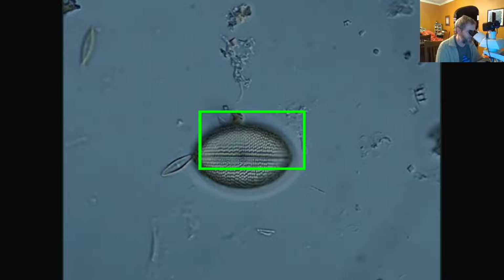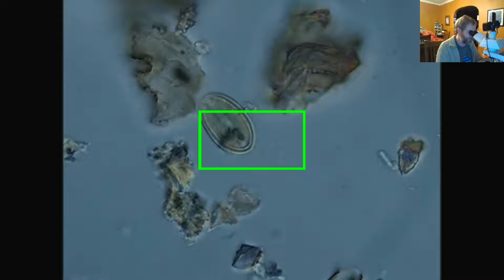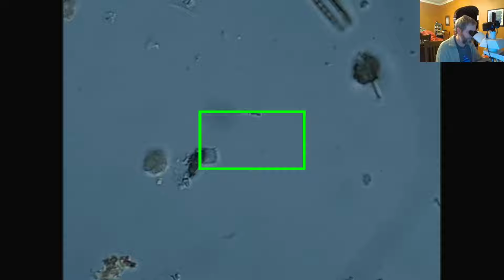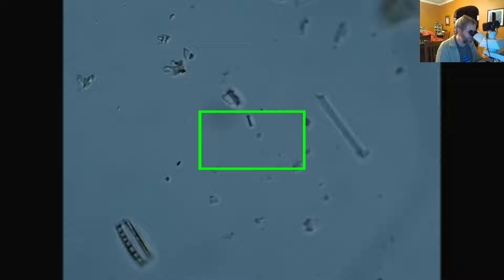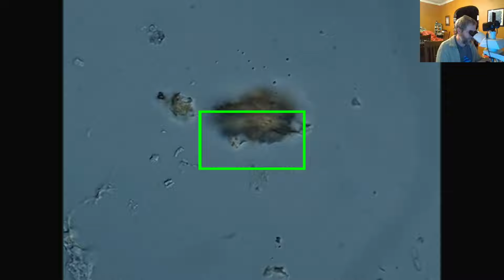And we don't see much of anything else except for these little tiny Achnanthes and Achnanthidium that are in here, which are not very indicative of anything. They're kind of like weeds. They grow everywhere there's space for them to get away with it, basically. So in most cases, they don't tell you anything. Maybe at the species level, we could use them to tell us something particular about the nutrient status of the system, or sometimes they only grow in flowing waters or something like that, but it's usually at the species level.